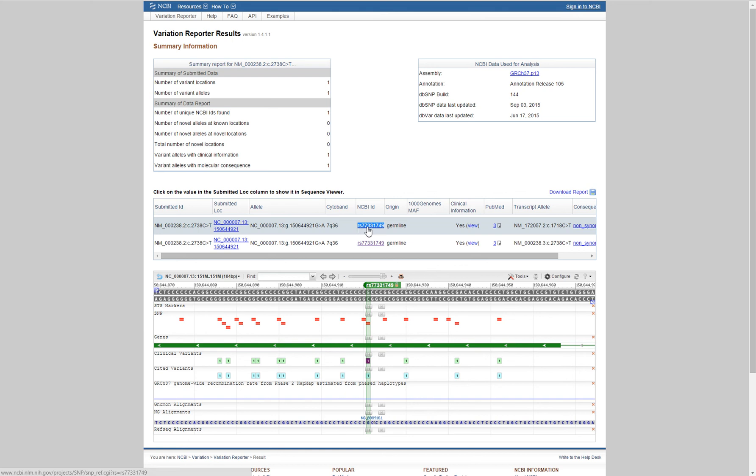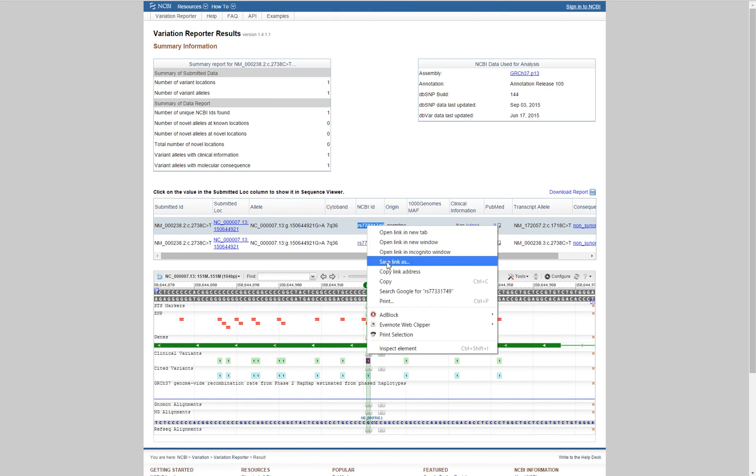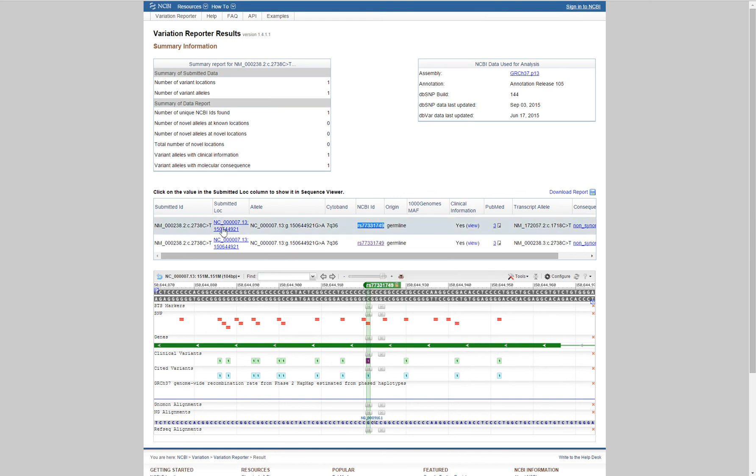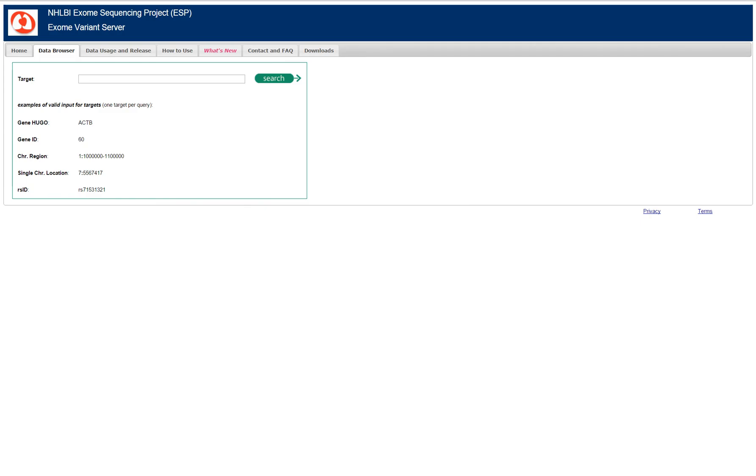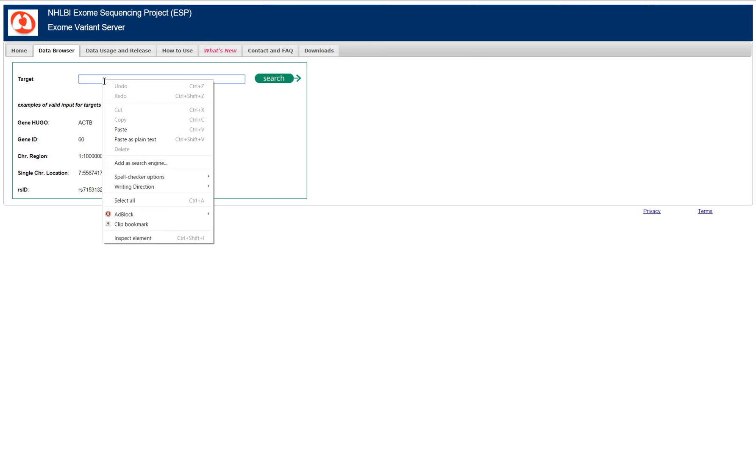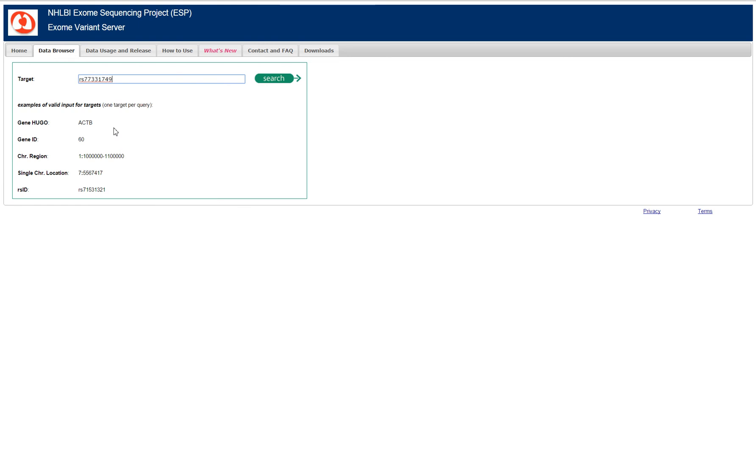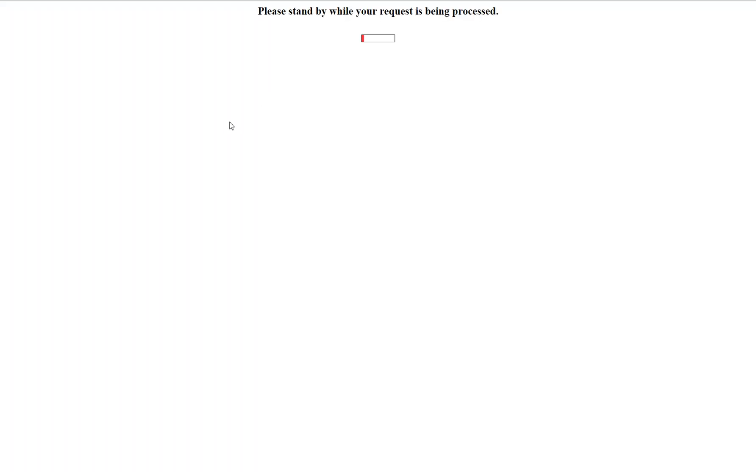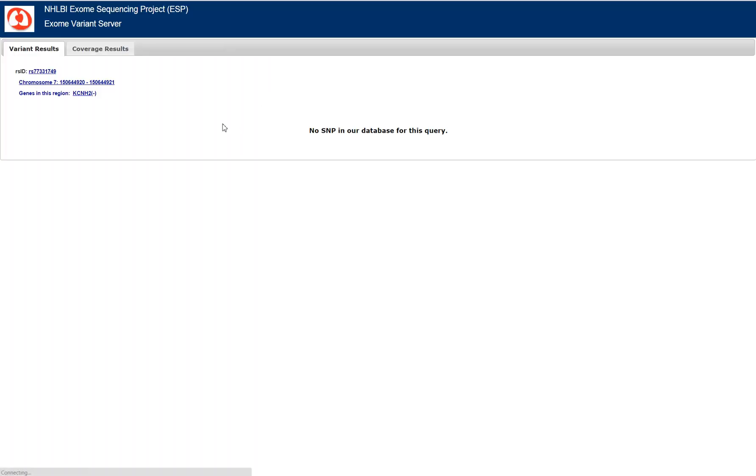One is taking the RSID for a particular variant. In this case, this is the KCNQ1 variant that is associated with potential long QT syndrome. The exome sequencing project has multiple abbreviations, so there's ESP and there's EVS. Nonetheless, you can just paste in the RSID here and search for the variant within the server.